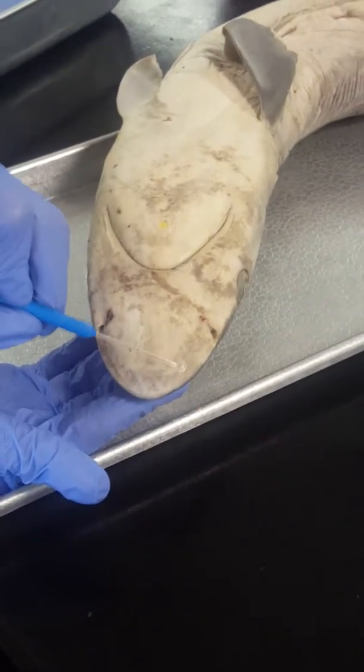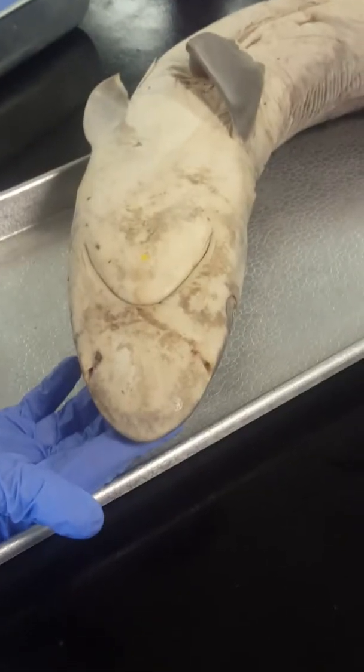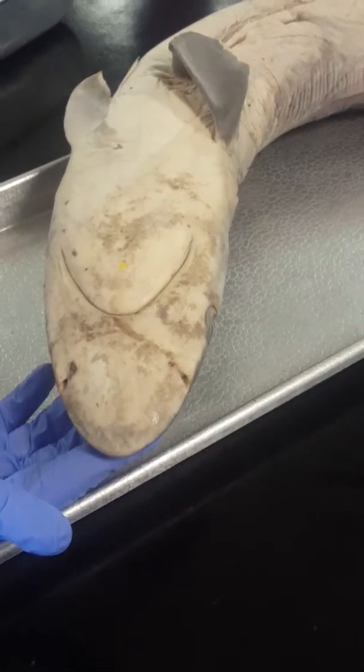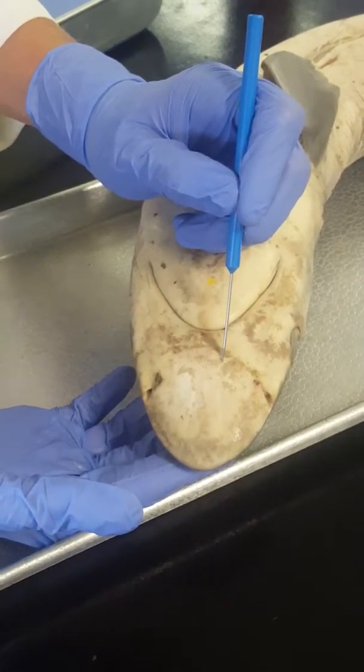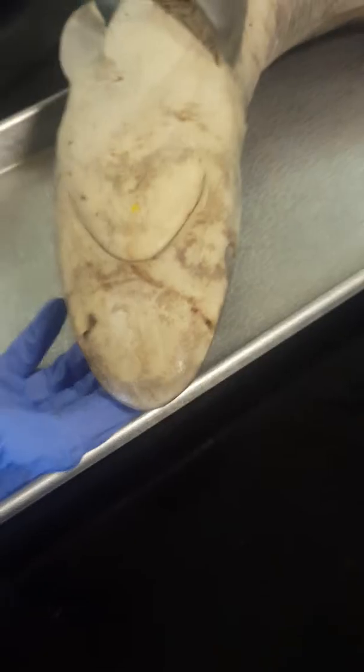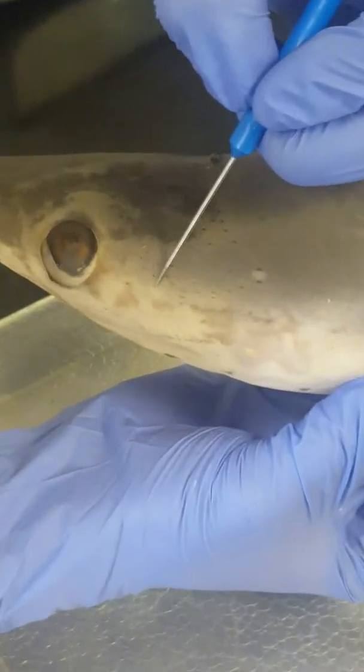Rostrum is located up here. Openings of Ampullae of Lorenzini are the little dark holes that are kind of all over the ventral side of the shark. The lateral line should appear similar to the openings of Ampullae of Lorenzini and should go kind of along the lateral side of the shark, all the way down the side.